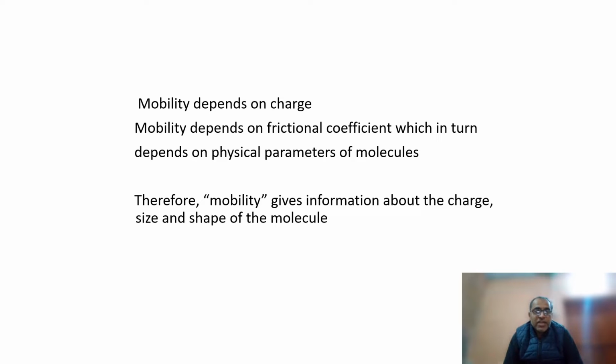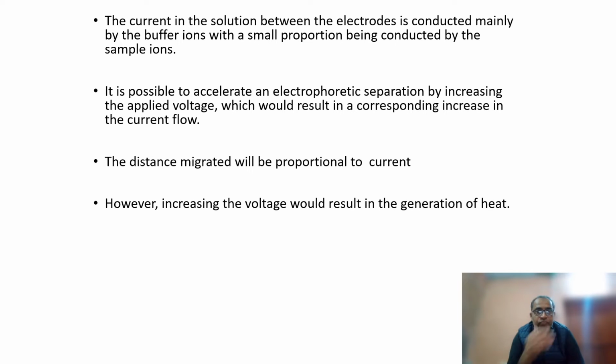Then mobility depends upon the frictional coefficient, which in turn depends upon the physical parameters of the molecule. Therefore, mobility gives information about the charge, size, and shape of the molecule. So that would give the information about size, shape, and charge of the molecule.